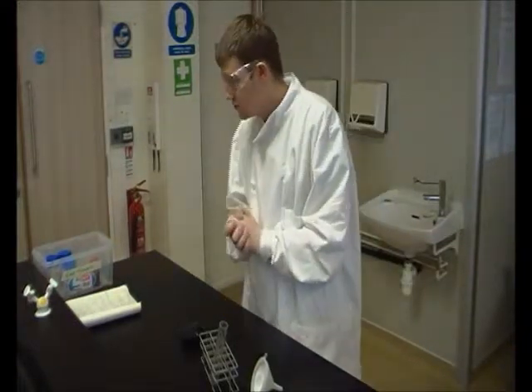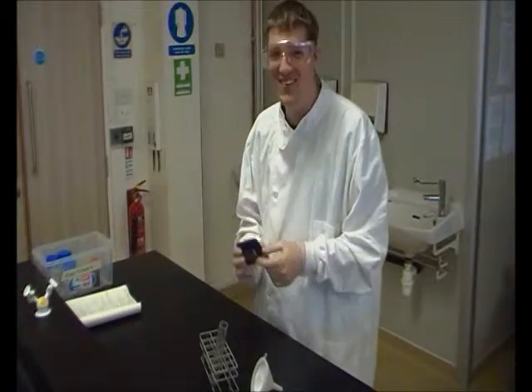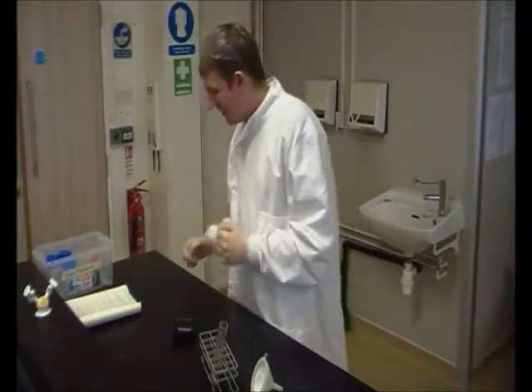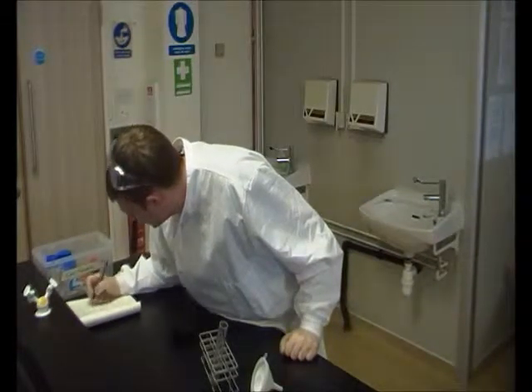So step one: we've weighed out 0.1 grams of nitrobenzaldehyde. Wait, what is that word? Nitrobenzaldehyde. Nitro... say it again? Benzaldehyde.